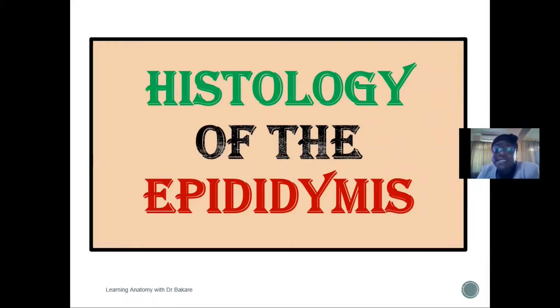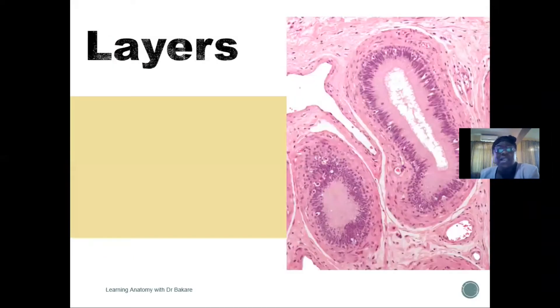Welcome. Let's look at the histology of the epididymis. We have done a lecture on the anatomy of the epididymis — you can check that to upgrade your knowledge. But for the purpose of this lecture, we'll be focusing strictly on the histology of the epididymis. When the epididymis is extracted and processed into histological section, this is the kind of presentation that we'll be seeing.